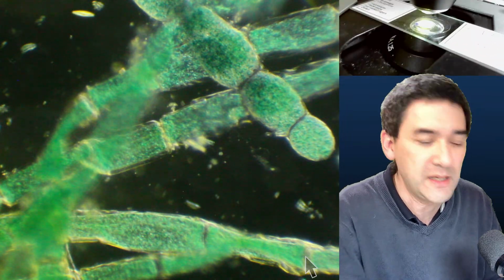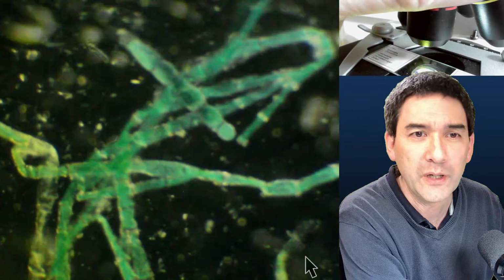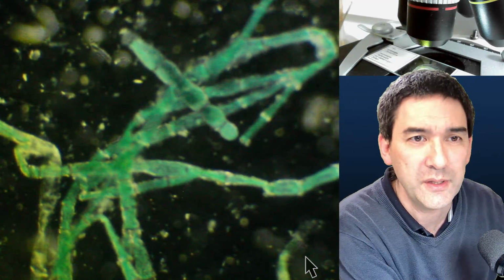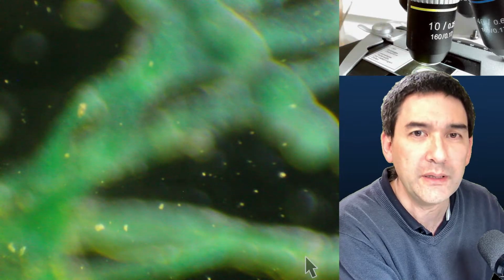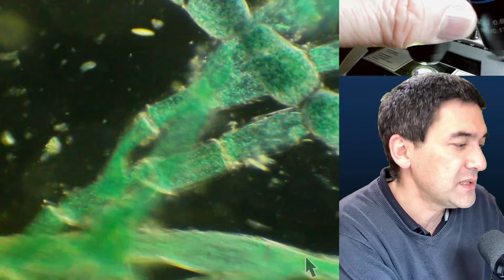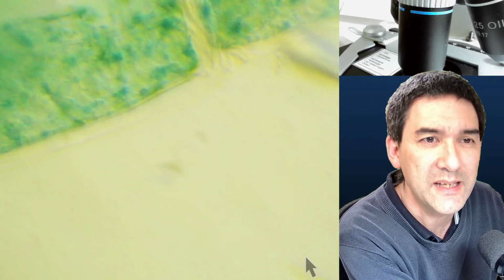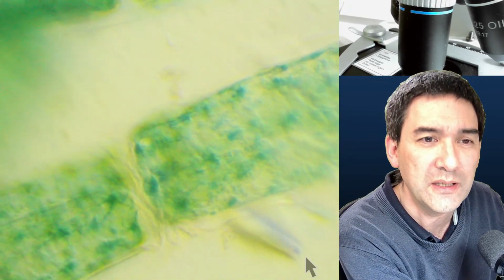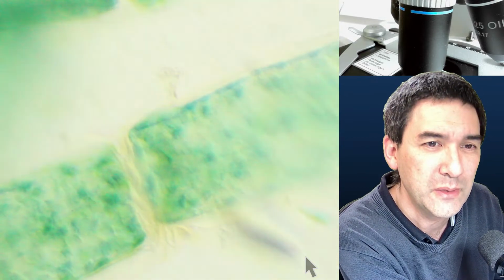You know what? That's actually something I can just show you as well. So this is now the 4 times, that's the lowest. Then 10 times, and anything more than 10 times, that's now 40 times. And this is how it looks. And see, that's the reason why the central disk has to be the correct size. Otherwise, we're not getting the proper effect. So maybe by recentering it a little bit, I'm able to get it.